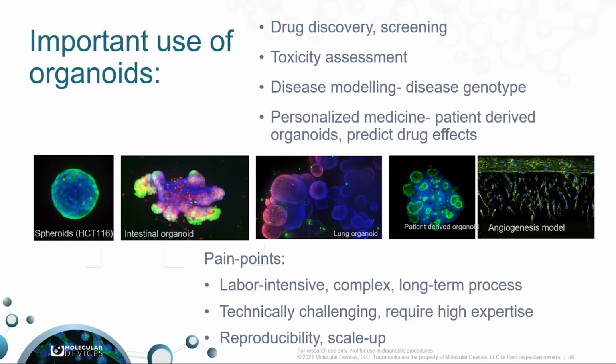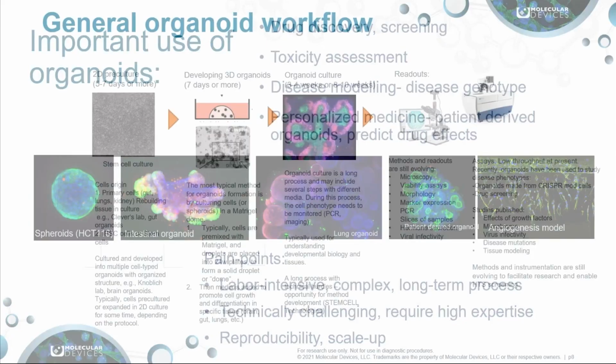But there are multiple pain points in using these complex biological systems. They are labor intensive, complex, long-term processes. Those processes are technically challenging and require high expertise from scientists. And there are also issues with reproducibility and scale-up of those assays.